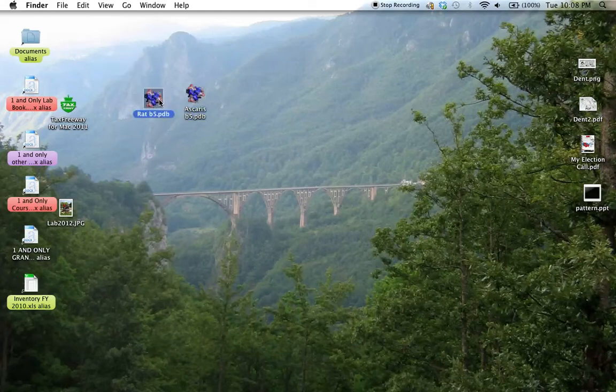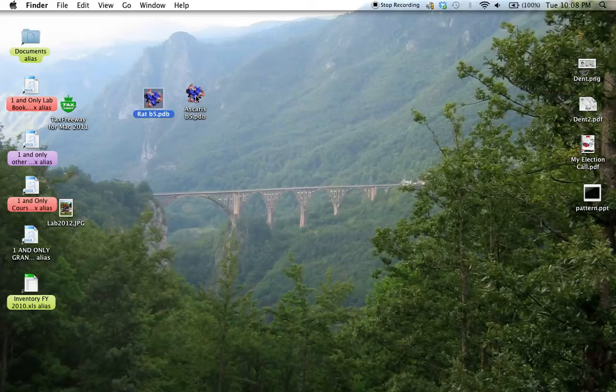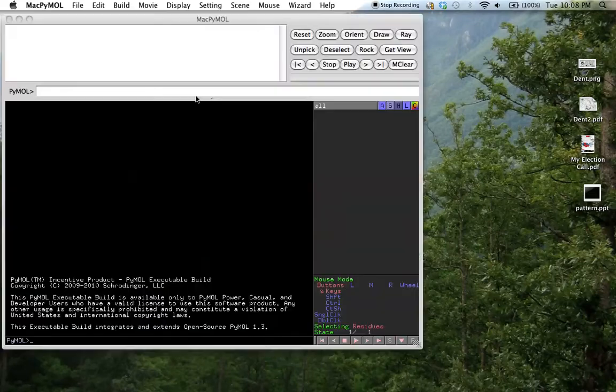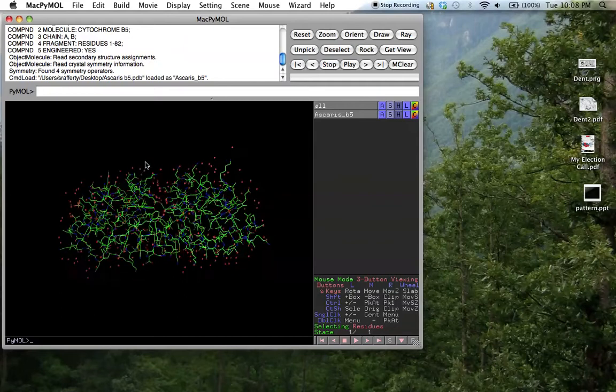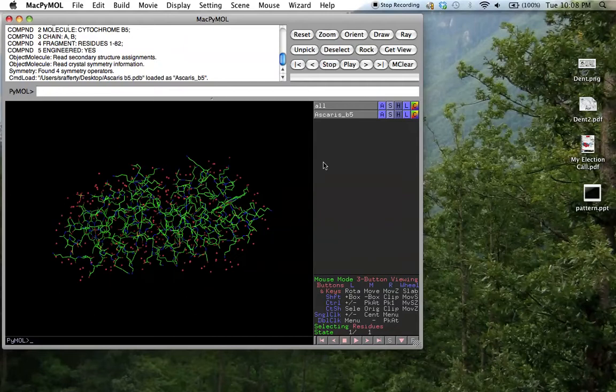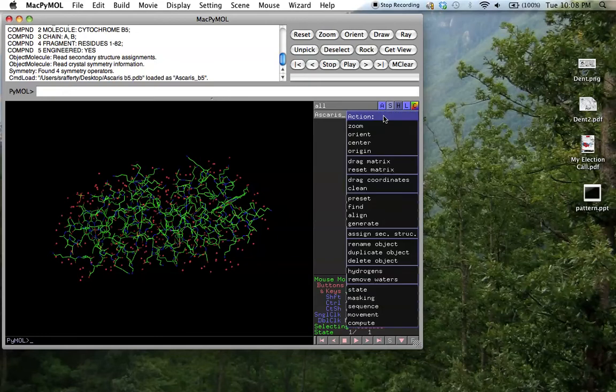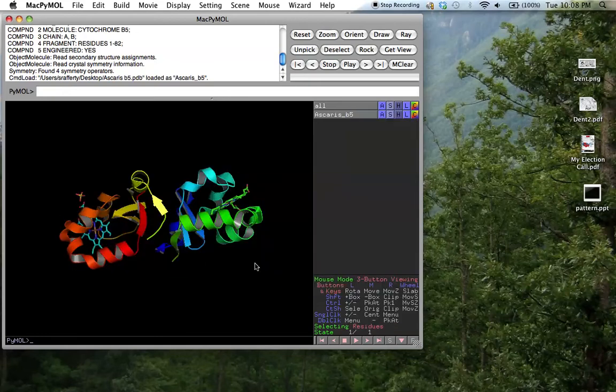And we'll open up the Ascaris structure first, because it shows something interesting that occasionally you have to do. I mention this in lectures sometimes. When you go to the protein database, sometimes what happens is that they load multiple structures. If there's more than one structure in the unit cell, sometimes you get two copies of the structure. This will become more clear when we change the view of the protein, the preset publication type.